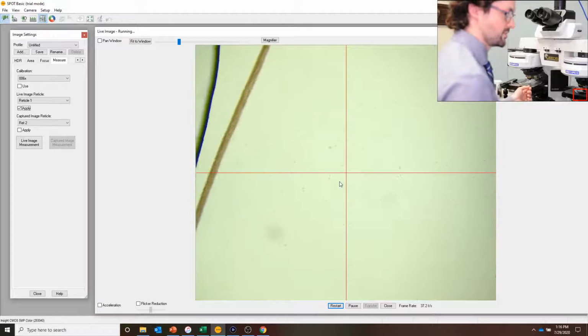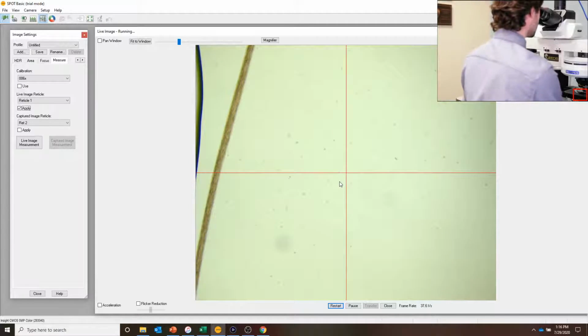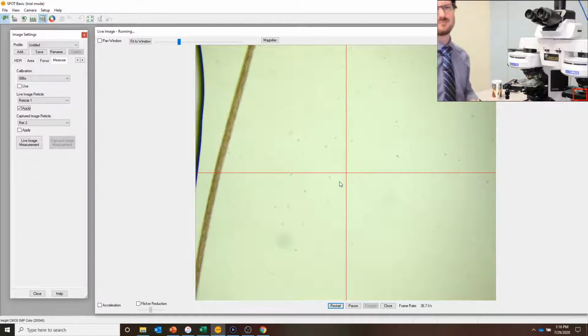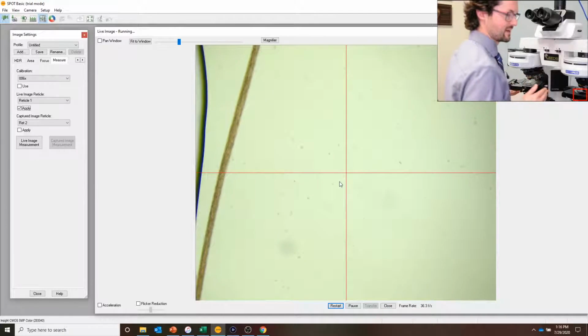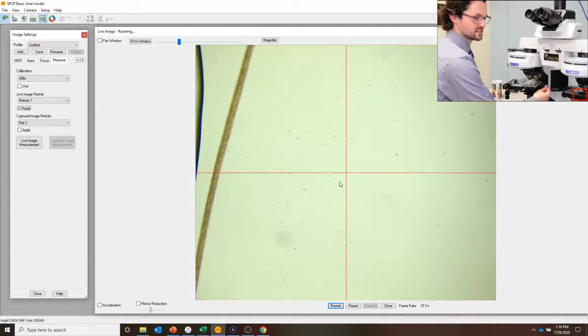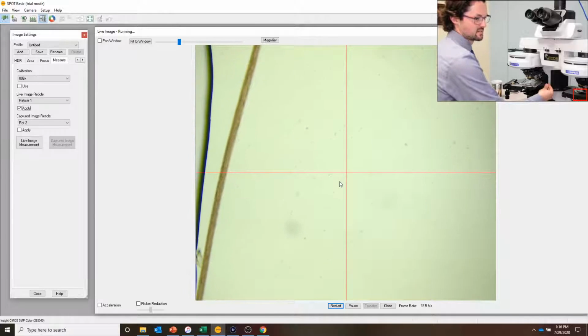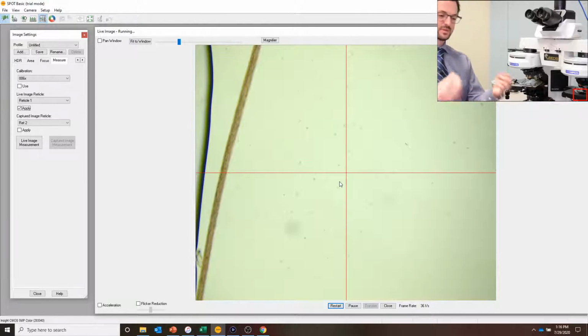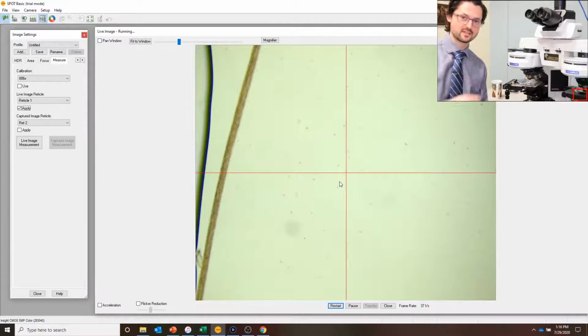And so then I'm going to go ahead and move my stage. Quick note, it's the Etch-a-Sketch, and I maybe overuse that analogy for microscope parts. But the left side has a leftward diagonal motion. The right side has the opposite diagonal motion. And so by using these centering screws, that's how we're going to move things around to try to get that crosshair onto that imaginary circle point.